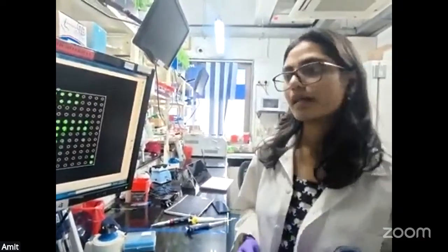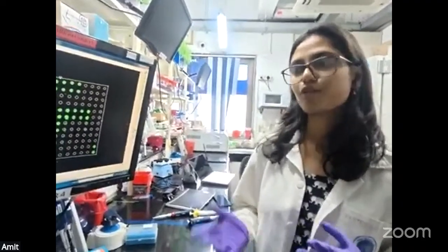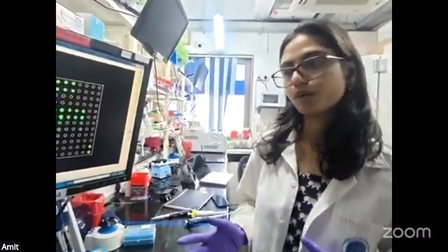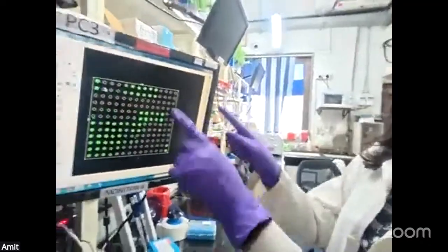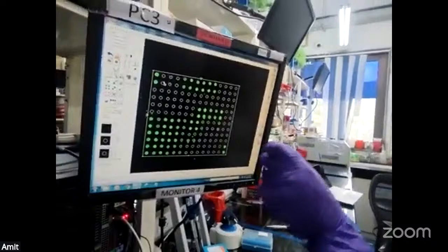The second way of checking our data is that we can perform a correlation plot. We can perform intra-block correlation, or we can perform inter-block correlation. Let me explain it to you. Intra-block correlation means that in one single block, we want to check the intensity of these data.